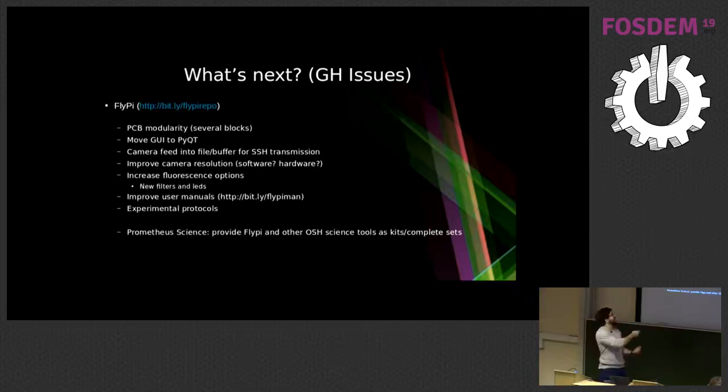Right? If you would then instead have everything via SSH, you could have several Pis, several of these devices connected to one laptop, and you could have remote connection with it. Also improve the camera resolution.